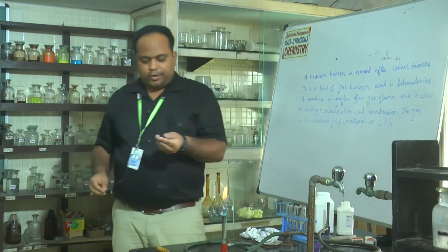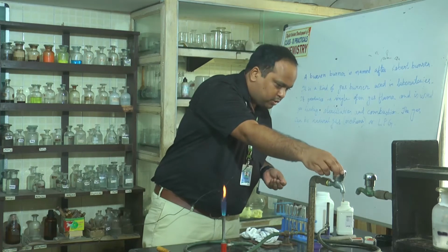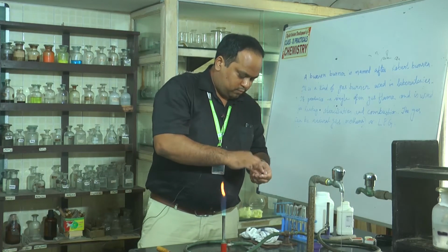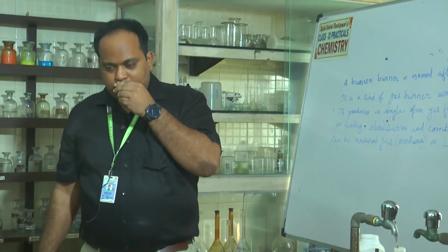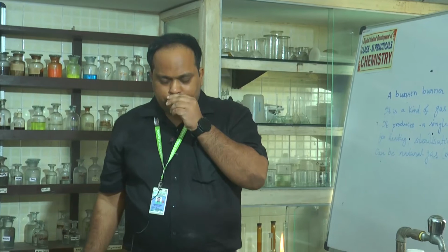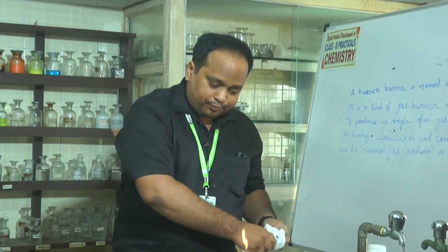Take a pinch of salt on your finger, and just put a drop of water. Rub this like this, and you can smell it. So you can feel it smells like ammonia. Clear? This is the ammonia smell.